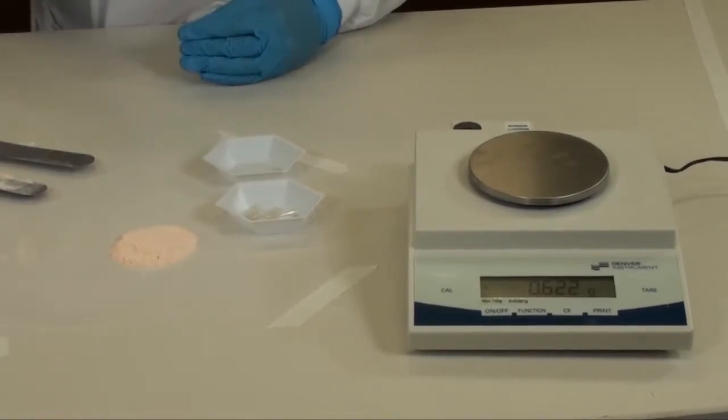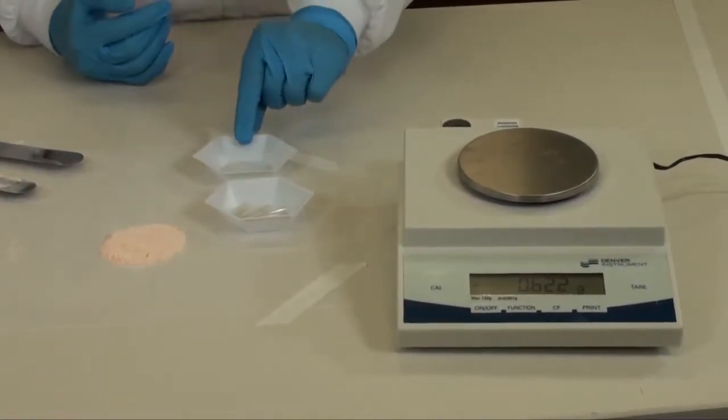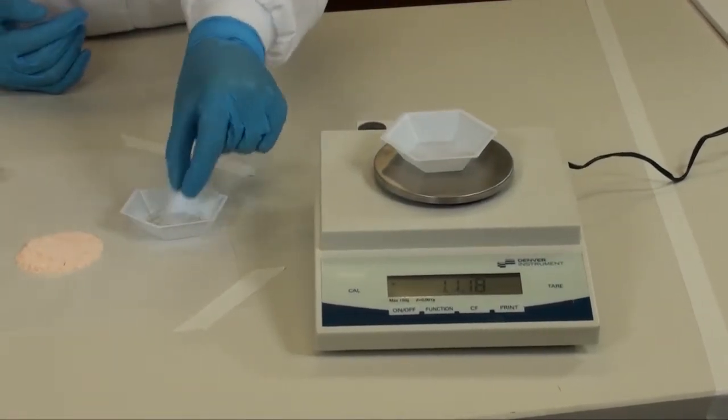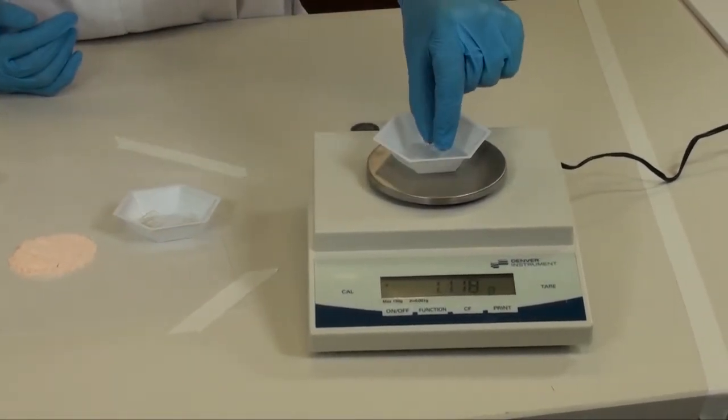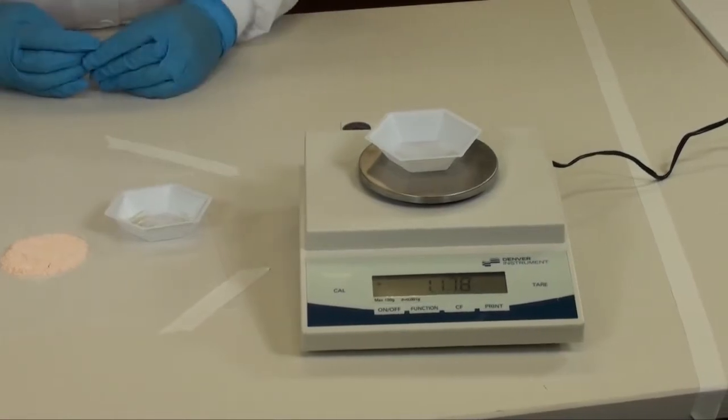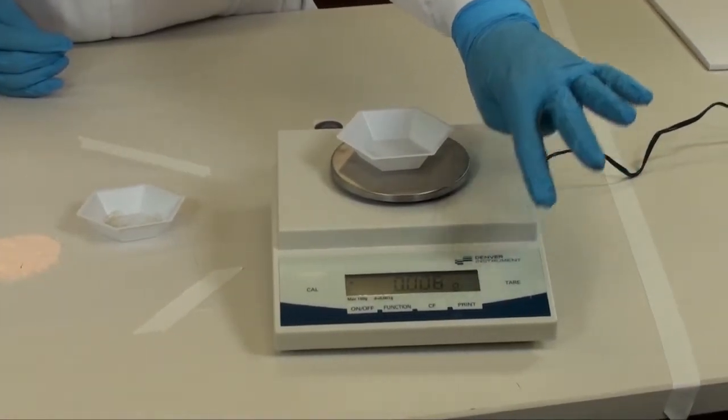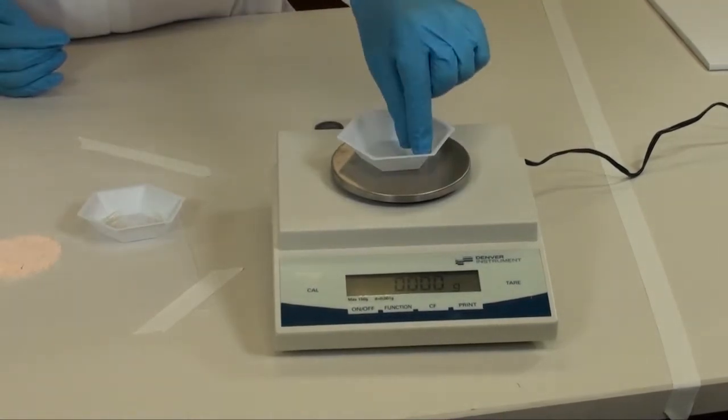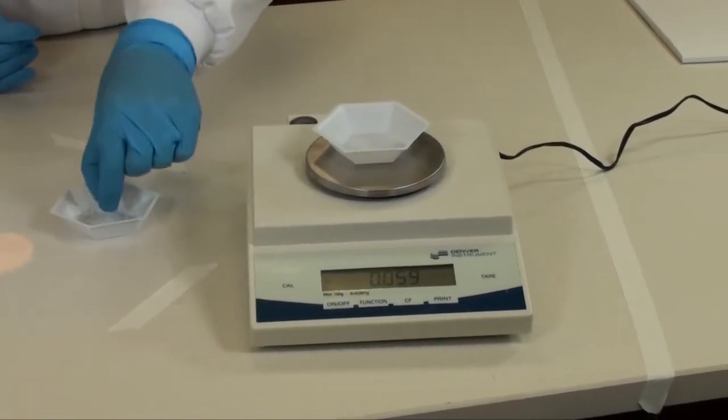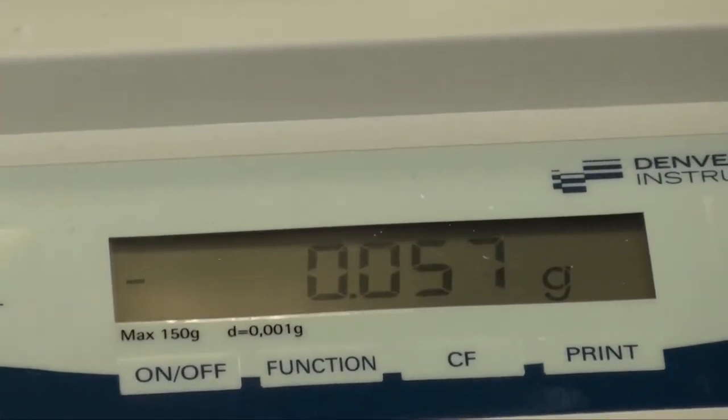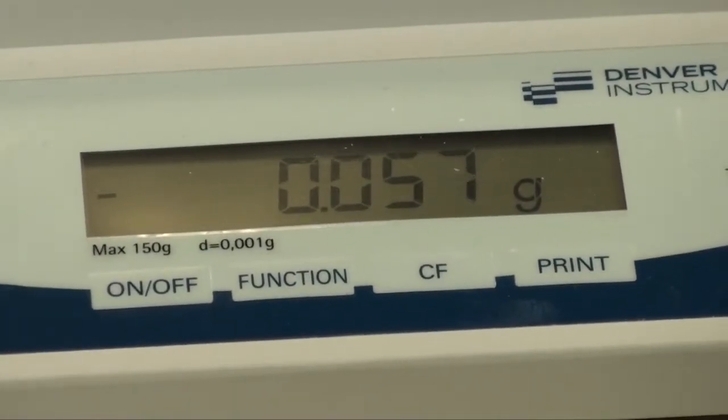Now get your scale ready for weighing. Place a medium weigh boat and an empty capsule, the same size that you are going to use in your prescription, and tare the scale. Remove the empty capsule. Please note your scale will read a negative number. Remember, this is the weight of the empty capsule.